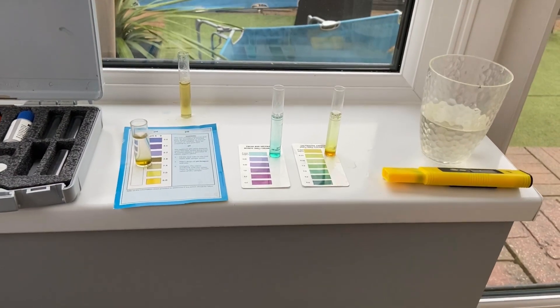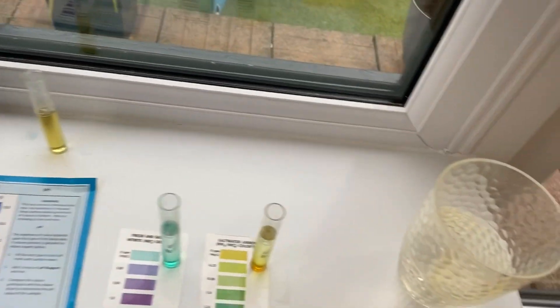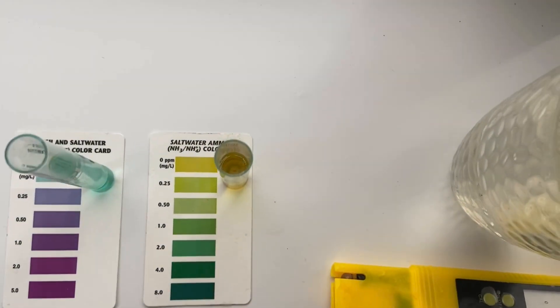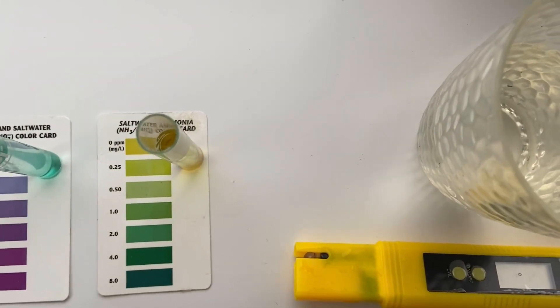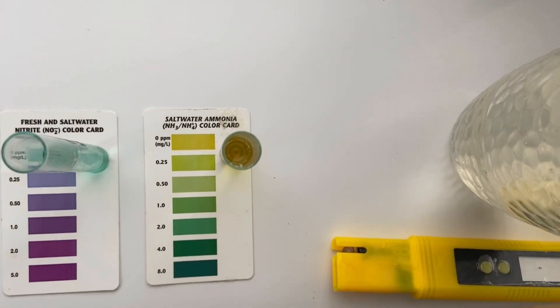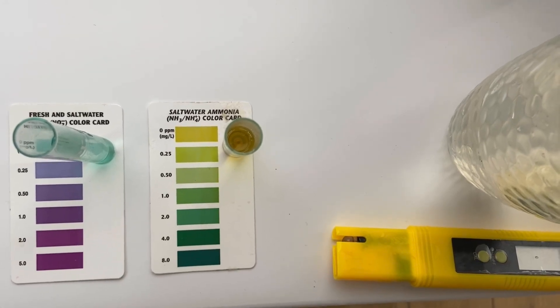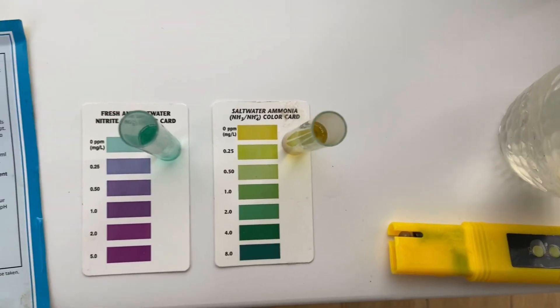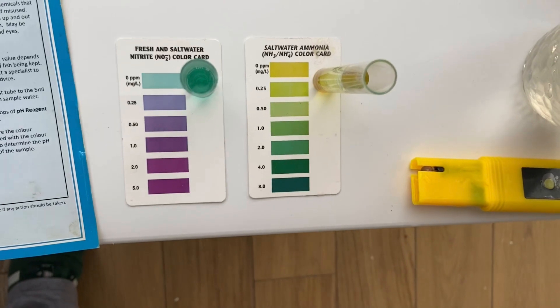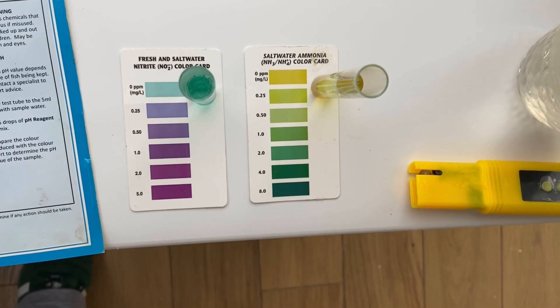What I find better is reading them from above. For example, my ammonia — if you look down there, that is no ammonia; that's the yellow color. And then my nitrite — you look at the color on that and there's zero nitrite in there.